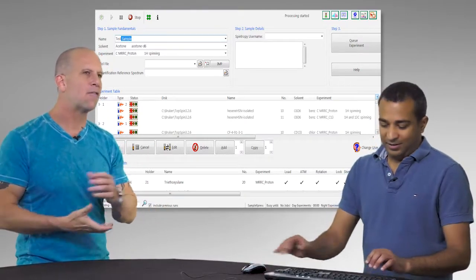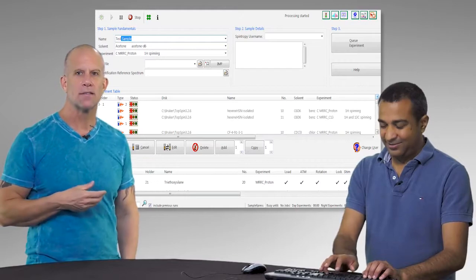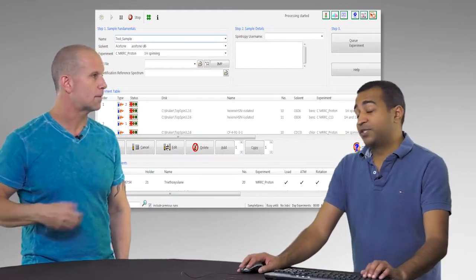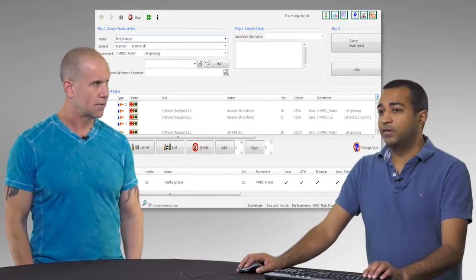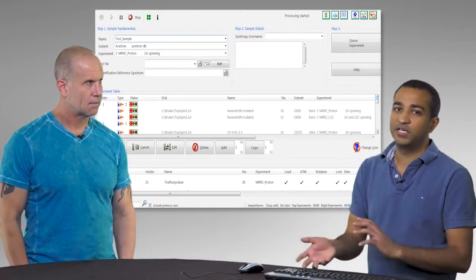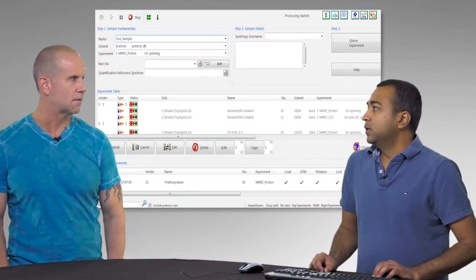And it's often not as big of a problem anymore as it used to be, but it's not really required here, is it? You can put a space here, and it handles it fine. There are some characters that it doesn't like, but we've gone through and tested a lot of things. Is there a length?